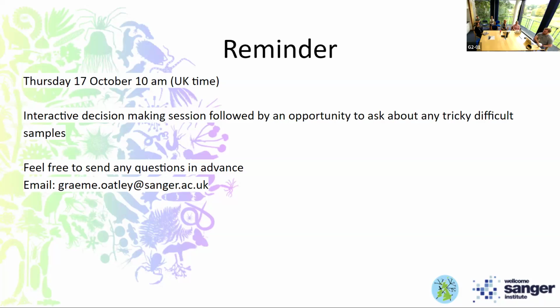Well, I think all our processes we can do manually, so they don't have to be automated on the Kingfisher. So you could definitely perform most of what we've shown you today on the bench top without a robot. But in terms of a smaller scale automation, without a Kingfisher, I'm not sure what the options are. I think Eppendorf have a smaller automation machine, which is not as big as the Kingfisher, which could do fewer samples.